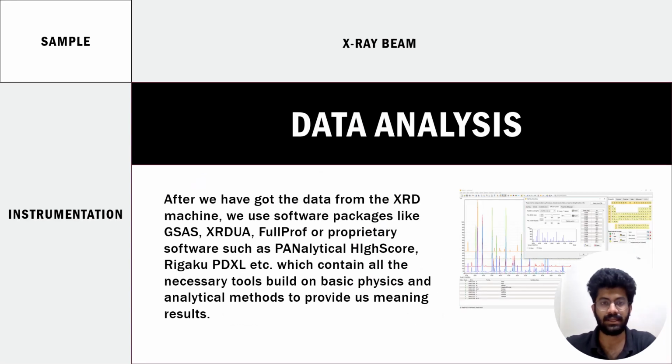Next comes the data analysis part. The data we get from the XRD machine is processed by software packages such as GSAS and XRD UA, which employ the physics and analytics to provide us meaningful results.